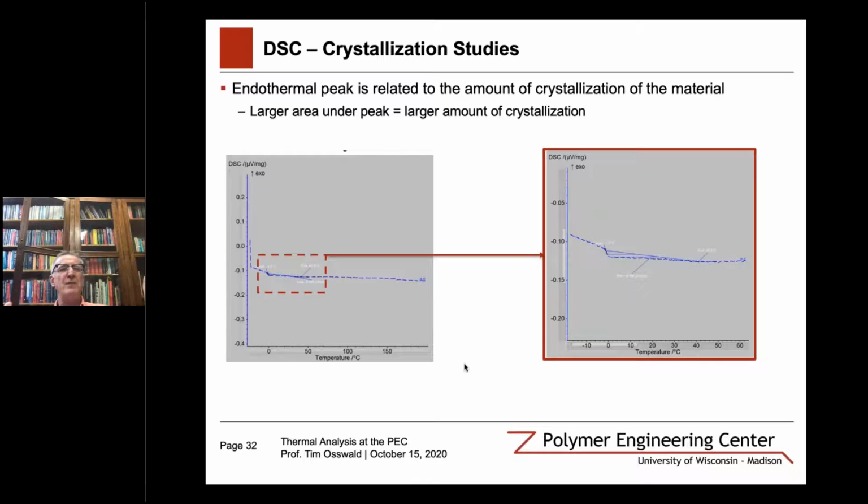Since rubber has a glass transition temperature of about -60 degrees C, and room temperature is way above that, at room temperature, over time, rubber will crystallize. And the question is, does that degree of crystallinity affect the properties of the material? It can be eliminated when you do a heating and a cooling. Obviously, it will disappear. But that's an interesting effect in rubber.